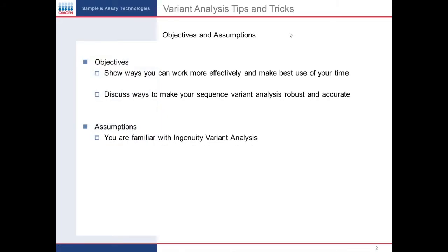Some objectives of what we're going to be doing today is really to show you ways you can work more effectively and make better use of your time using the application. I work with people all the time out in the field who are using variant analysis, and I see where people get stuck and some of the things that cost them time, where there are some easy solutions to help them out.